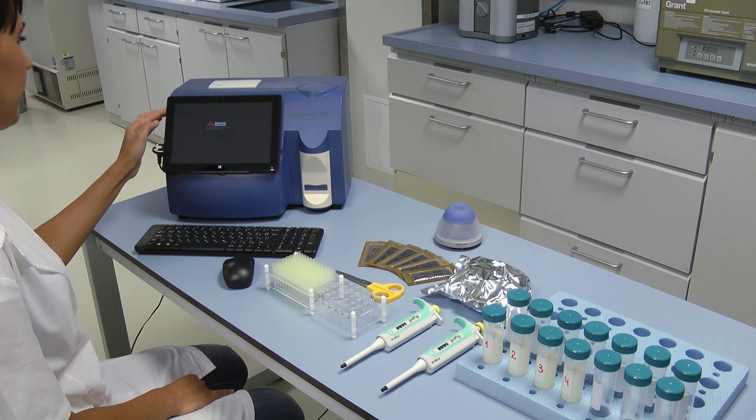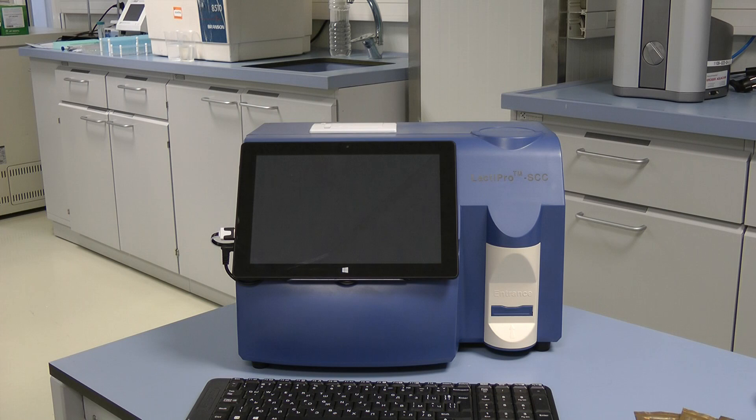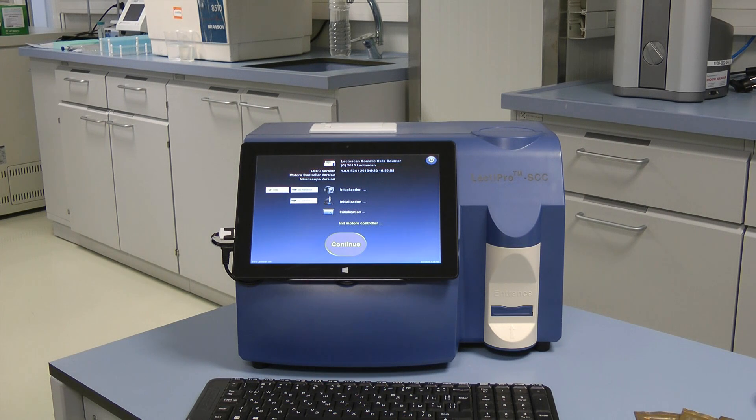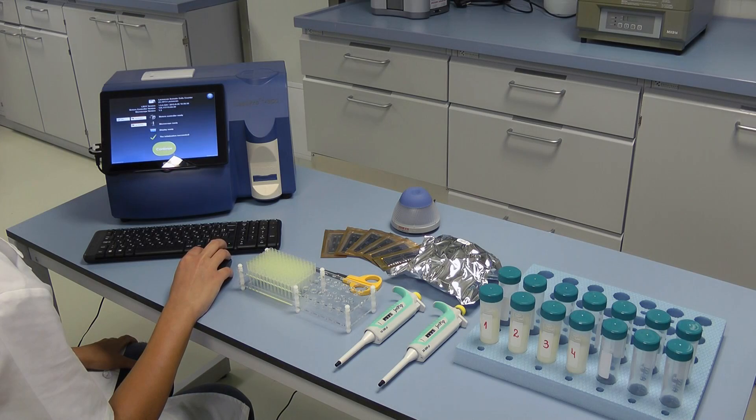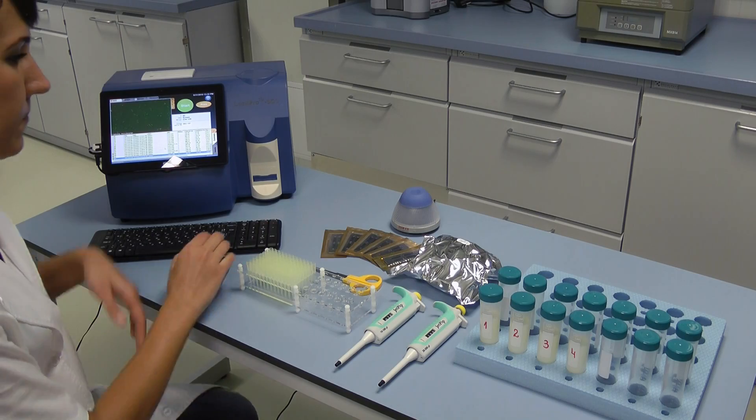Press the on button of the screen as well. The first thing you will see after switching on is the Display Initial. Wait for a couple of seconds until everything is loaded and then press the button Continue in order to proceed to the main display. The device is now fully switched on.